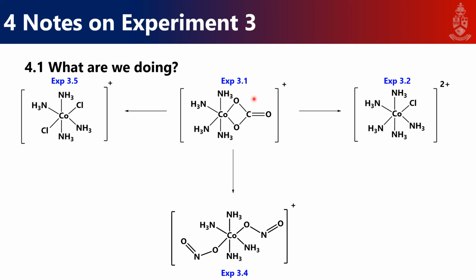And the only experiment that you start with cobalt chloride is experiment 3.3, which you make the hexaamine complex. So that's a separate synthesis. So that one you can breathe a little, but the rest of them are all reliant on experiment 3.1. Okay. And yeah, that's essentially it. So that's how they all fit together. 3.3 is on its own.